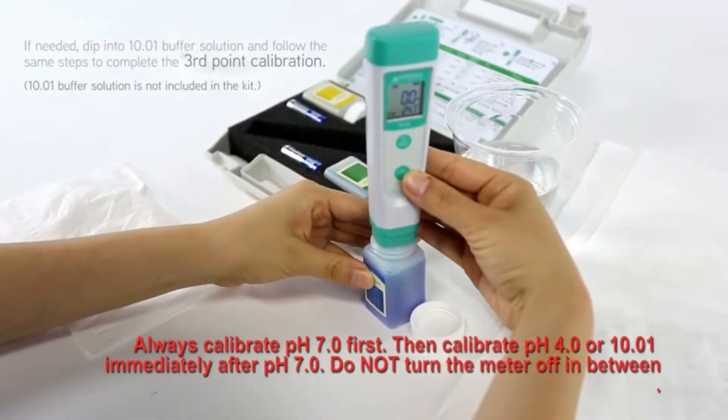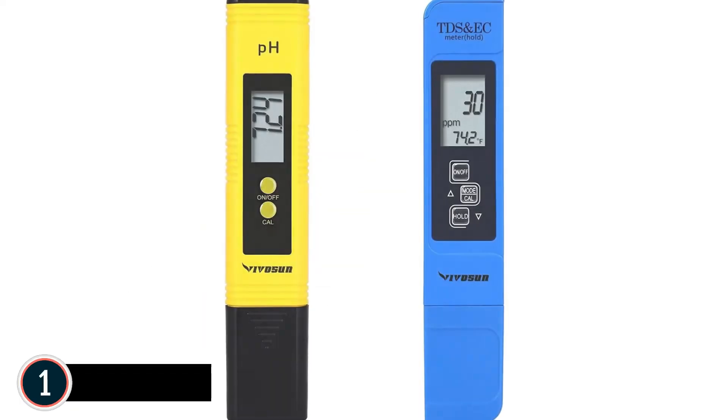IP67 waterproof, up to 2,000 hours of operation powered by AAA alkaline batteries. The item is CE certified and is made under an ISO 9001:2015 certified quality system. The top one in our list: VIVOSUN Hydroponics pH Meter.